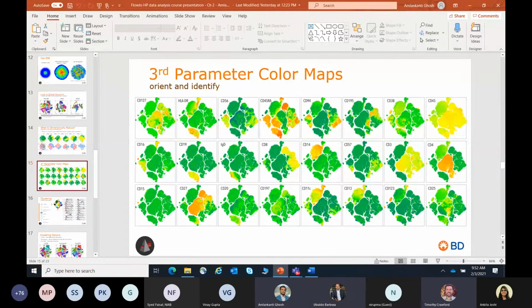Maybe in this experiment, the HLA-DR staining wasn't that great, but you can see CD14 and CD11c and CD13 there in the monocytes, which is that island up at the top. And if you follow a monocyte island out into the peninsula that's way up at the top of this plot, you'll notice that you get really high CD45RA as well as CD16 expression. And so you can see the monocytes there, and then the patrollers that actually have lower CD14, lower HLA-DR, but express CD16 and CD45RA.